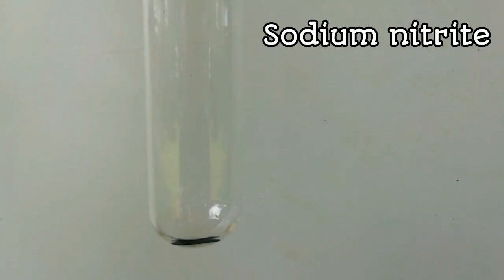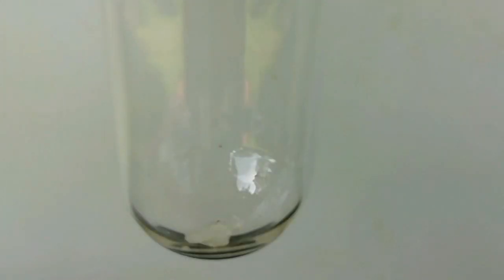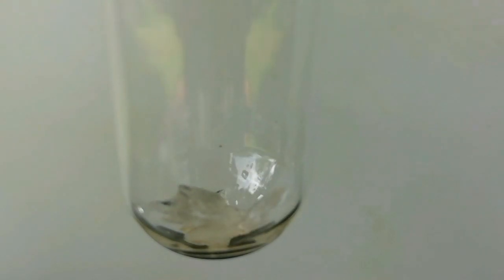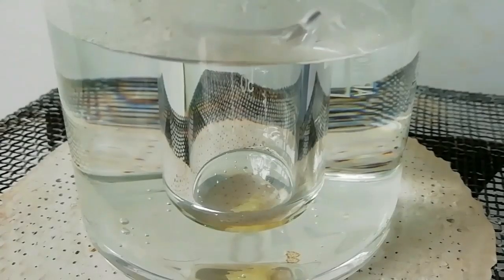First, add a very small amount of solid sodium nitrite. If you add more, it will react with sulfuric acid later and destroy the experiment. Then add a crystal of phenol and heat it in a water bath.